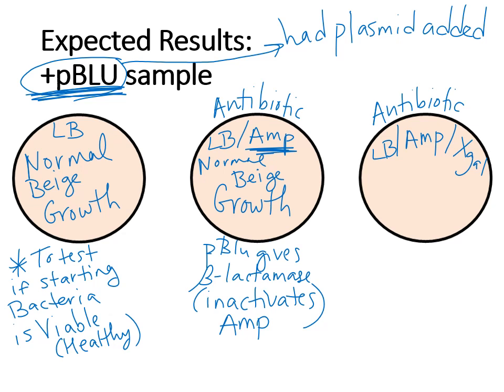And that is because there is no XGAL in the plate. Okay? So you do not expect any color to the growth. So no XGAL in the plate, hence why you expect beige growth. Okay, because the plasmid and the bacteria do contain at this point beta-galactosidase, but there's no XGAL for it to cut in half, so there's no blue produced.